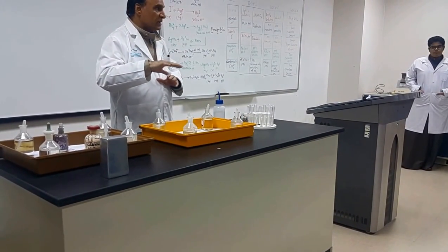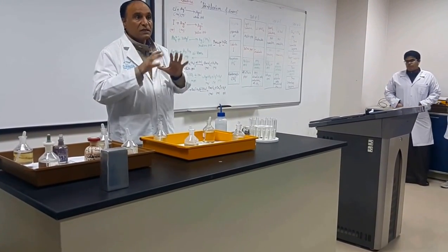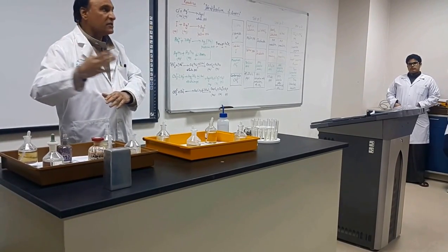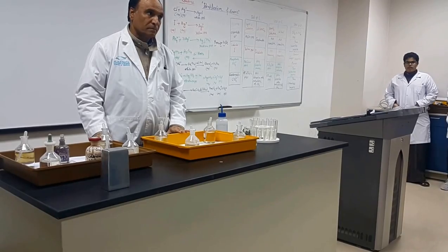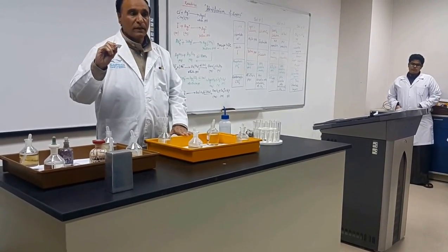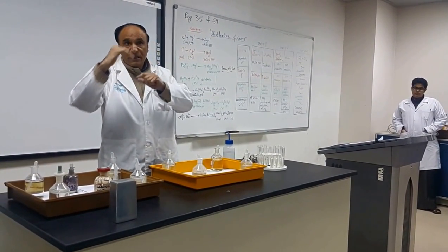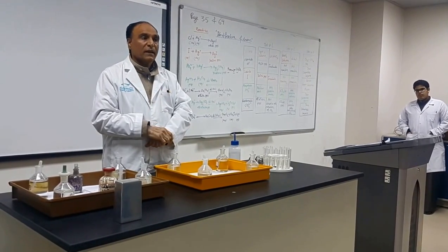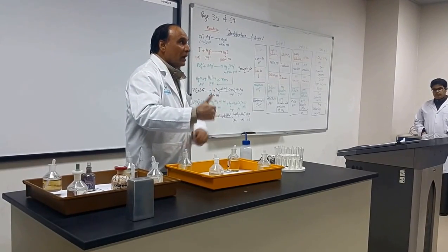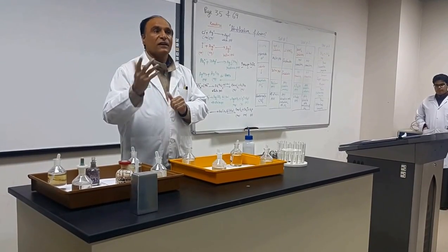This will give you an idea how to do the analysis of the ions. So just to give you an idea, the experiment is made simple since you have never done such an experiment before. I have selected 4 anions which are very common and which are also present in the water. The water which you drink, these 4 anions are also present there. So it will give you an idea how you can do the analysis of the ions if they are present.